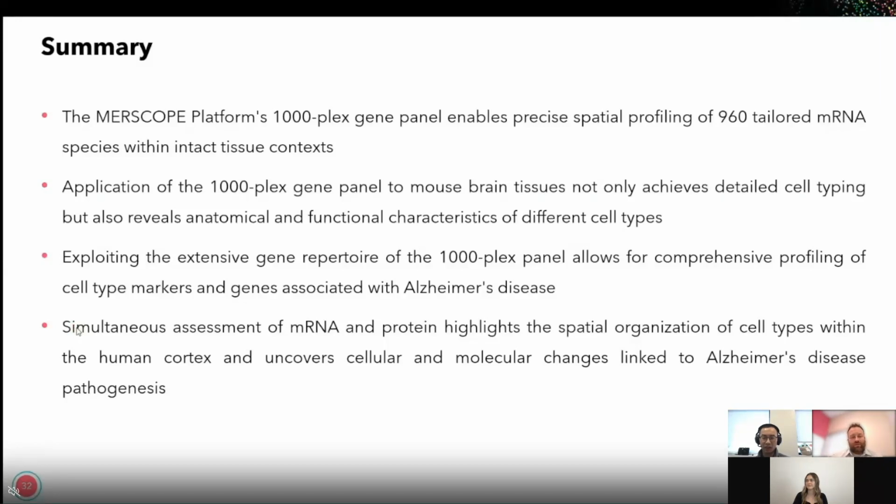Currently, I'm doing the differential expression analysis. I think that's actually an interesting point, because the cells may not be that healthy in that area. So even in the same cell type, for the same genes, we can maybe see some difference in transcript density. Thanks.